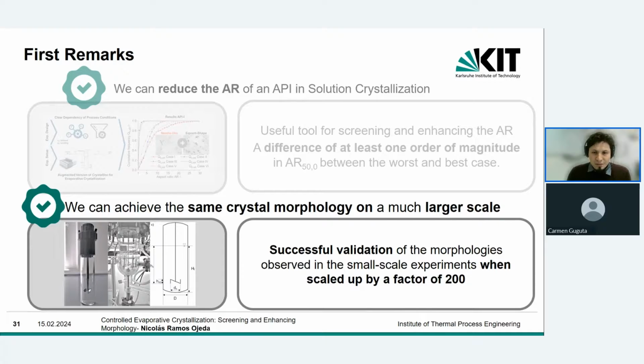So we were successful in keeping overall the same morphology, but the variations in crystal size expose expected issues influenced by spontaneous nucleation and agitation regimes that were not entirely equivalent. But this insight becomes more crucial for future scaling up steps, and in those endeavors, for sure, more meticulous control over this aspect should be undertaken.